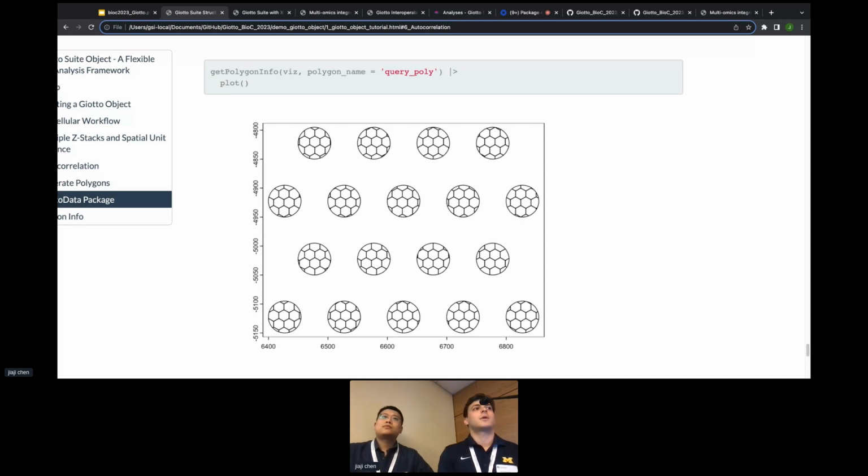No, our Python code, we use our Leiden clustering through Python, but the majority of the Python code that you're seeing on our repository is just the interoperability functions that I wrote, just to go from ingesting an AnnData object, piping that into R using reticulate, and going back and forth. I'm not sure that I can best answer the question for how we can be best assisted. If it's the question of which one do we have more packages of, it's R. Yeah, we want to get this on.